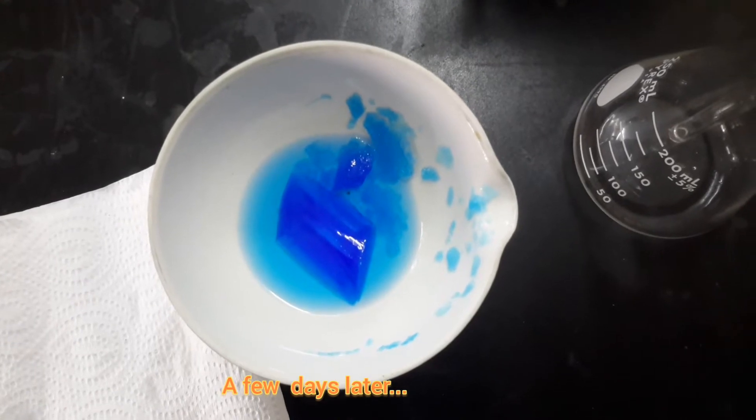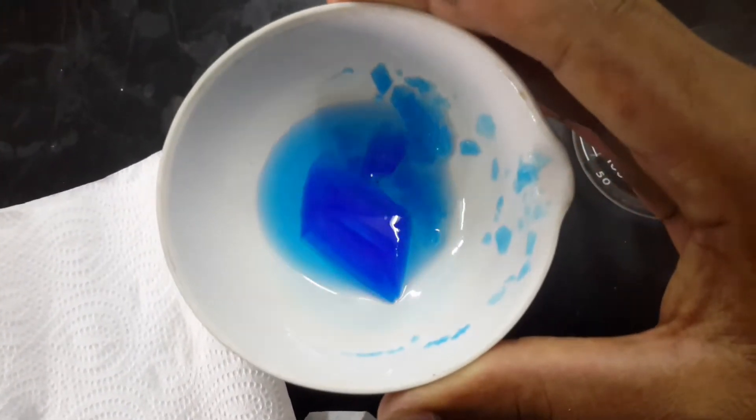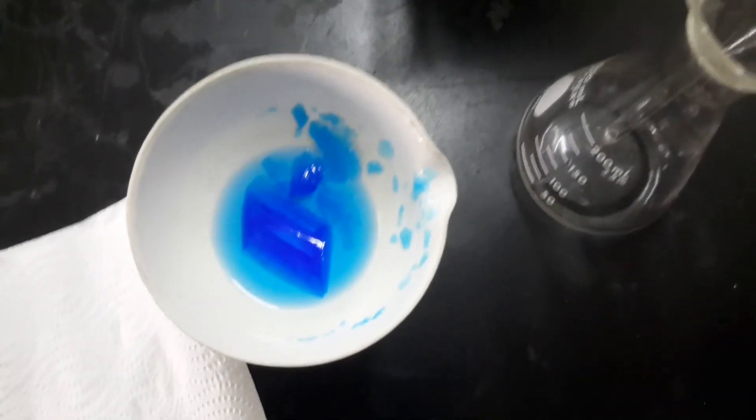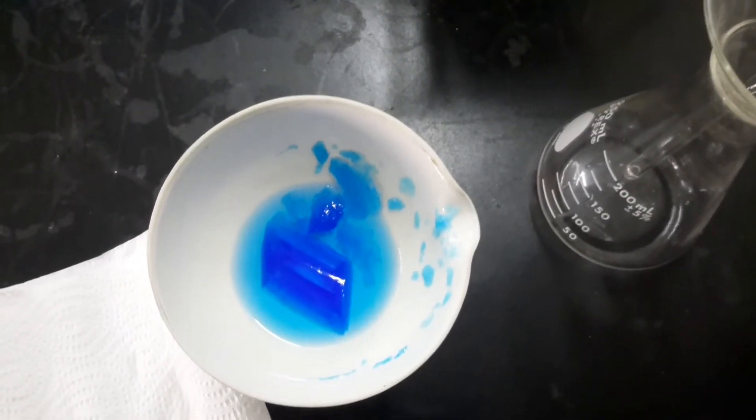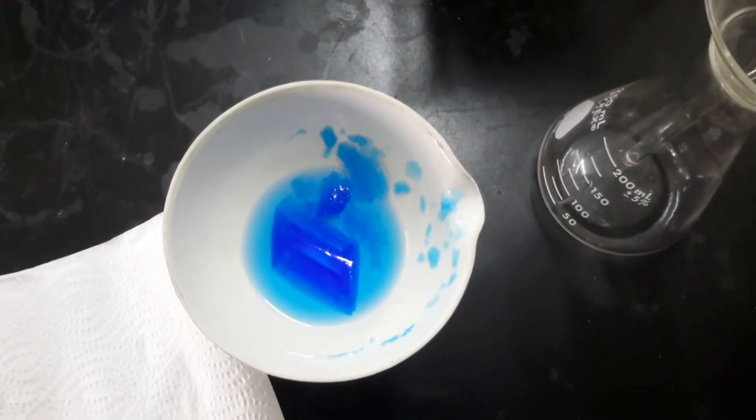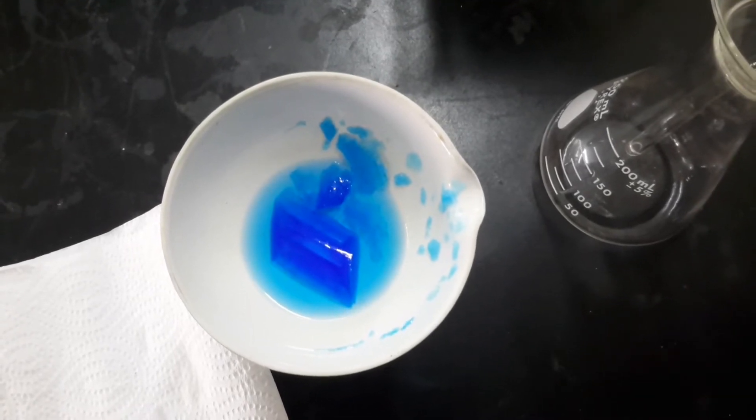Days later, the crystals or copper sulfate crystals are ready to be removed or separated from the mixture. We're just going to filter this off and then we're going to just rinse it, rinse the crystals with minimum amount of distilled water, and then we pat them dry.